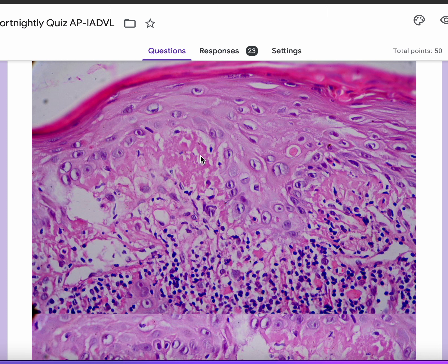There is a theoretical explanation with regards to lichen amyloidosis: lichen amyloidosis is indeed derived from keratinocytes, just like colloid bodies, and the initial stage in the formation of cutaneous amyloid is indeed colloid bodies. So this is probably a transitional phase between amyloid and isolated single colloid bodies.